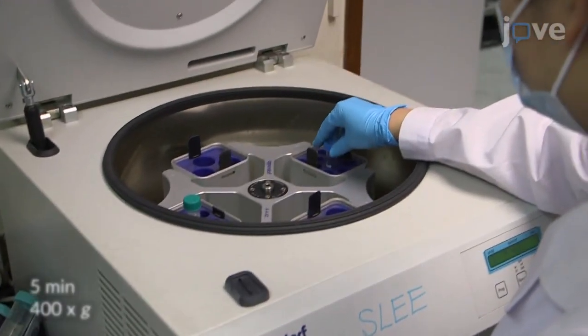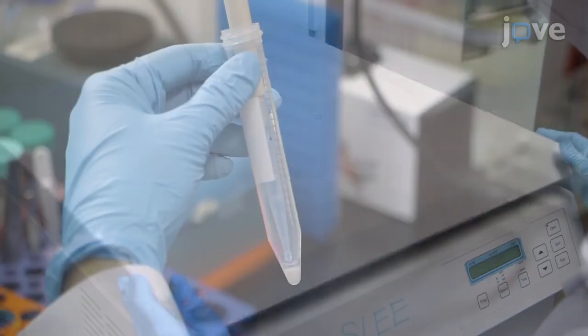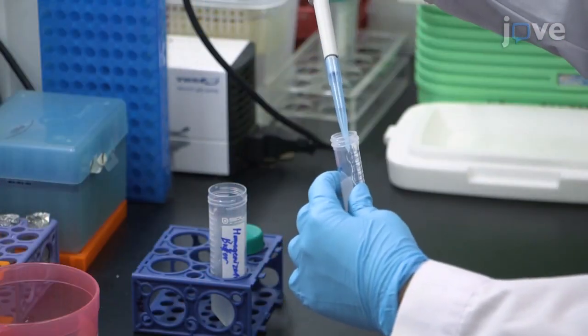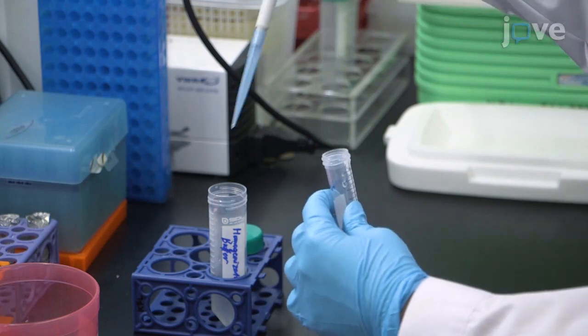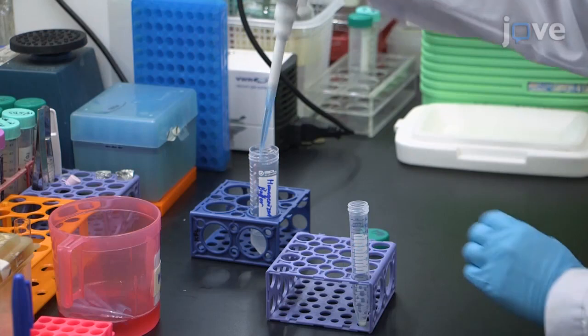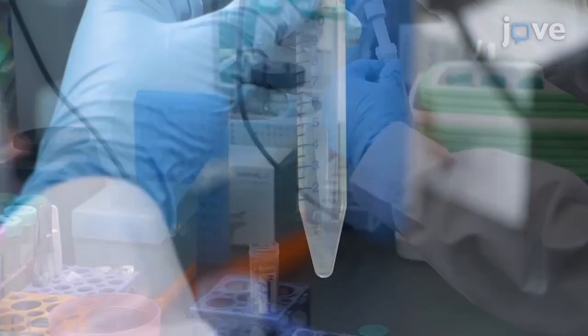Pellet the cells by centrifugation using a swing bucket rotor. Discard the supernatant and re-suspend the cell pellet gently in 5 mL of homogenization buffer. Collect the cells again by centrifugation and re-suspend the cell pellet in 1 mL of homogenization buffer.